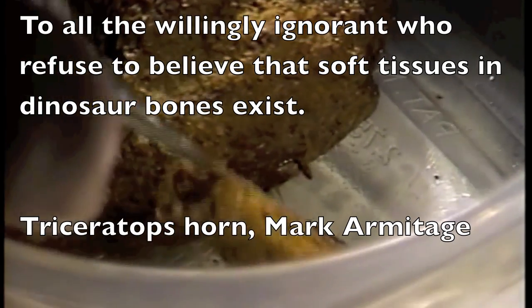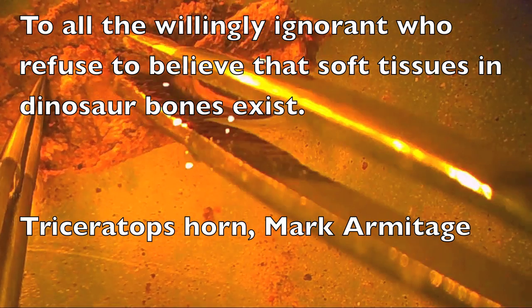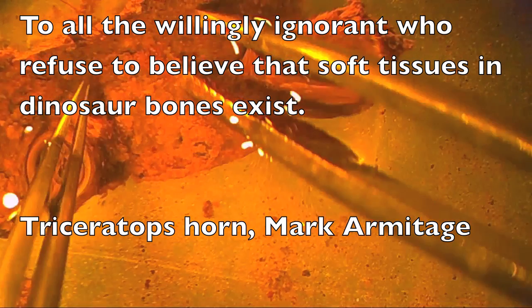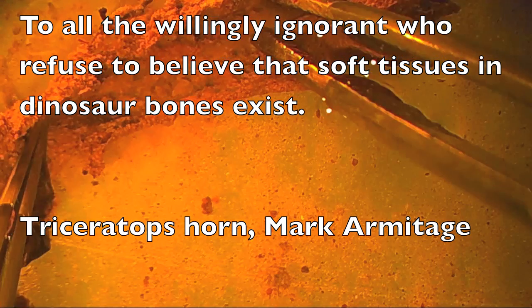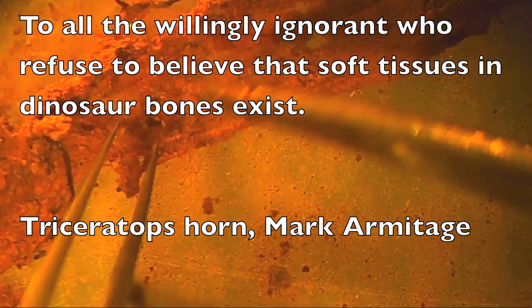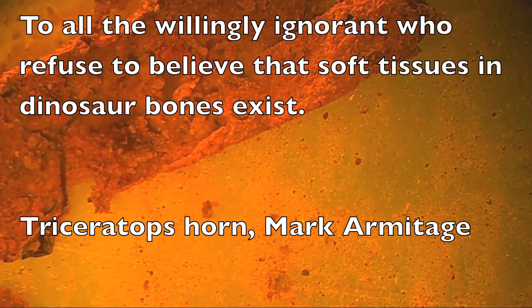Now this soft, stretchy piece of tissue is being shown here, being stretched to almost twice its size and bouncing right back. This again is soft fibrillar bone sheets that came out of the bone before it was processed in EDTA or any other chemical. This is direct evidence that soft tissue in dinosaur bones is right in the bone from the start.